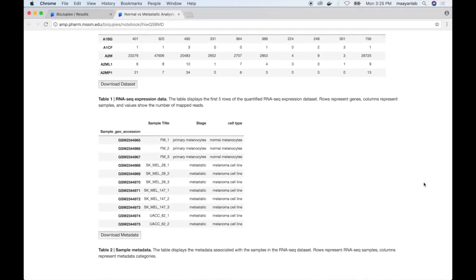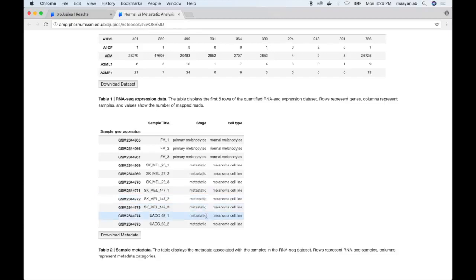Information is also provided regarding the metadata describing the samples. In this case, we can observe that the dataset contains three samples generated from primary normal melanocytes, and the remaining nine samples generated from three different melanoma cell lines. Similarly, the user can download the metadata to a text file using the button shown here.